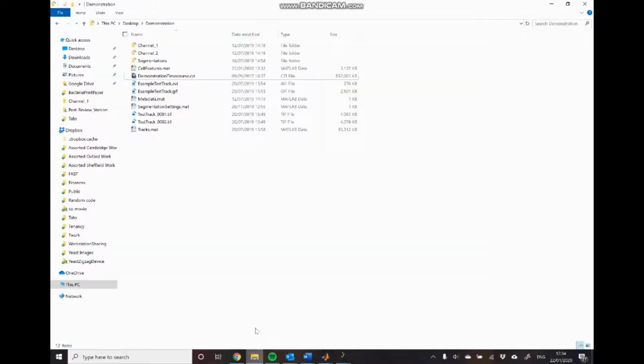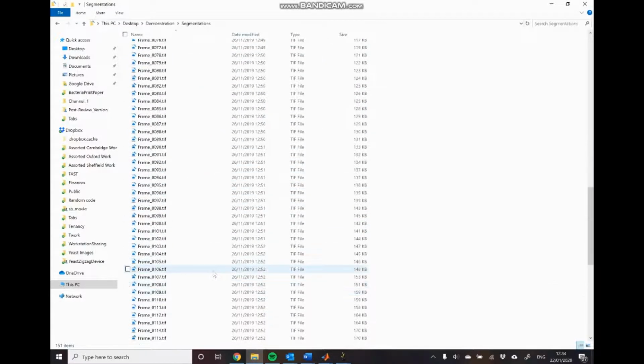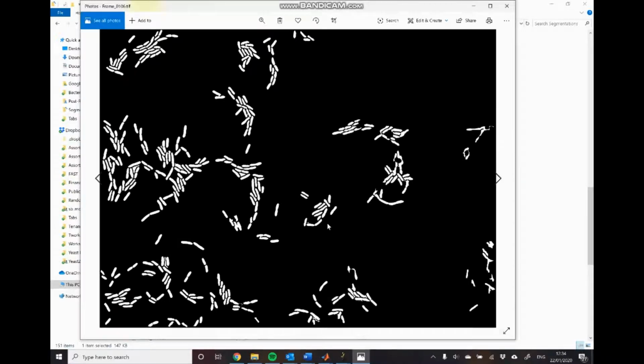In the last video, segmentation, we saw how we could extract these different cells at each time point, generating a mask for every cell as a white object on a black background. So we have this list of images now showing where each cell is at every time point, and now we want to extract information about these cells over time. We want to know, for example, where the cells are. We want to know how brightly they're fluorescing, and we also want to know their morphological characteristics, so their length, their area, their orientation, etc.